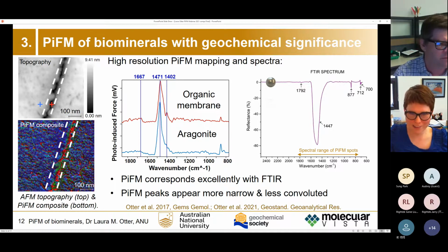That's okay. We have found in quartz, if it's a crystalline quartz, particularly based on the crystal zone orientations, depending on how that crystal is formed, we will get different spectroscopic responses. But if you were to look at it as an ensemble, then you would get this smoothed FTIR response.